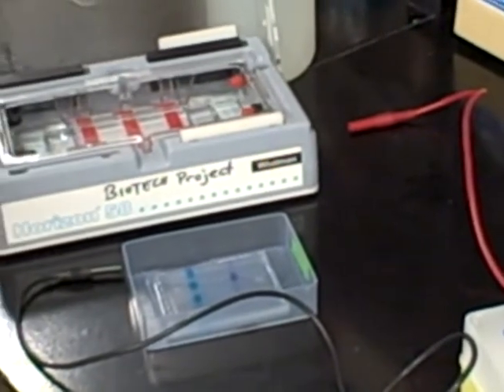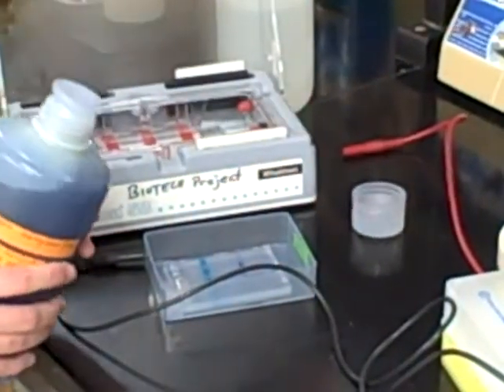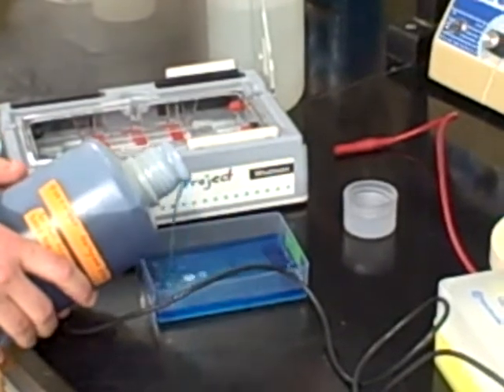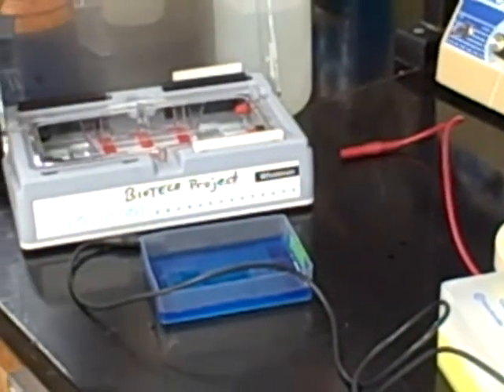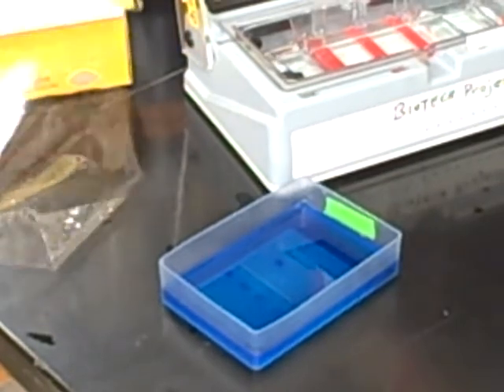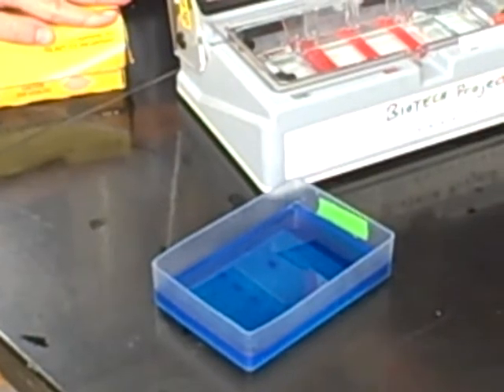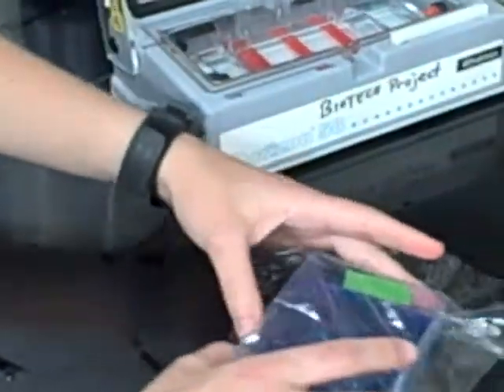Pour the methylene blue into the staining box. You want to pour enough to cover the gel — the box should be about half full. Cover the staining box with saran wrap and set it aside to stain overnight.